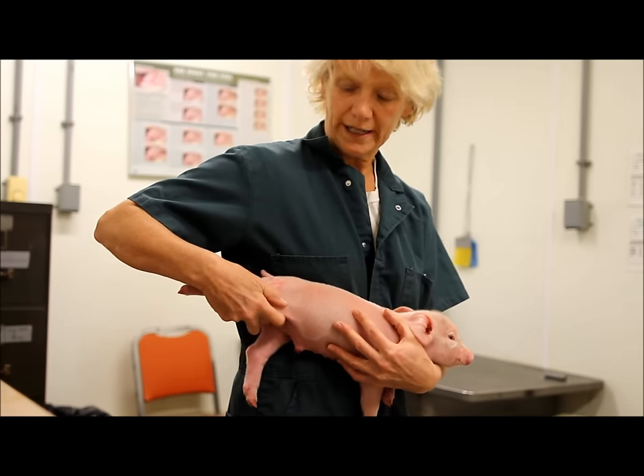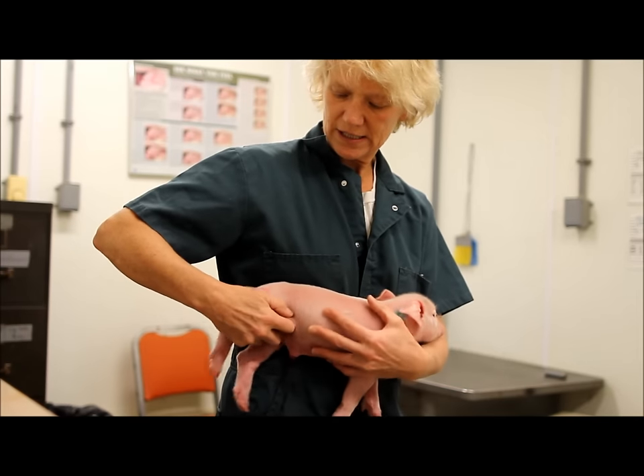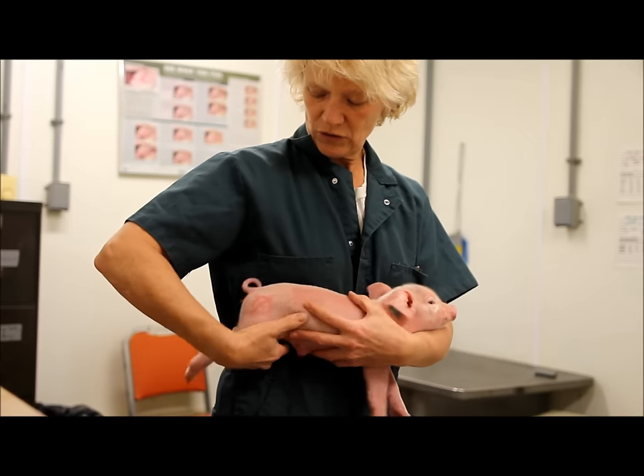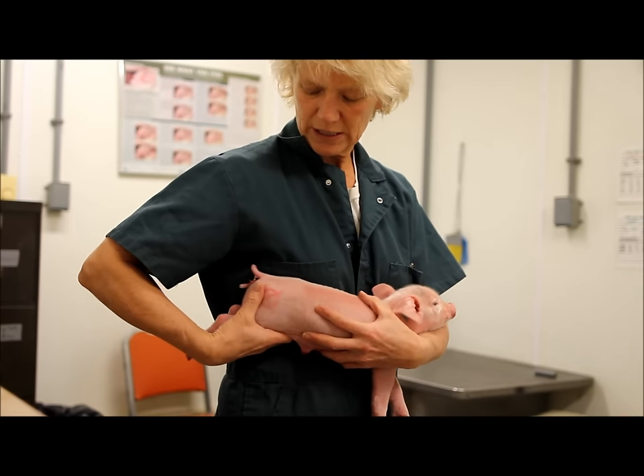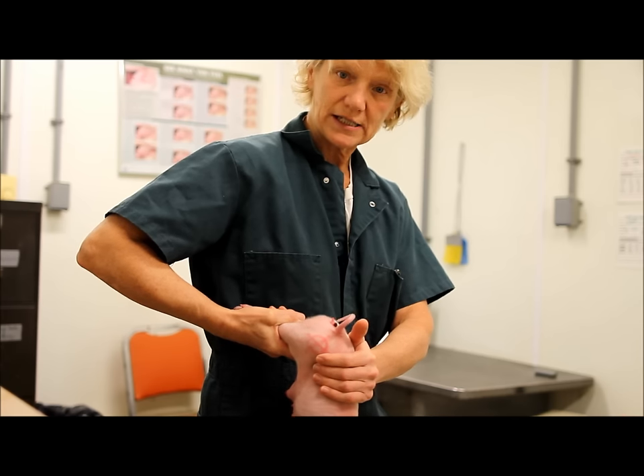Never hold a pig by one leg. If we hold a pig by one leg, it can twist and cause what's called a luxation, or really hurt the hip. If you do need to pick up a pig, please pick up the pig by two hands, like this.